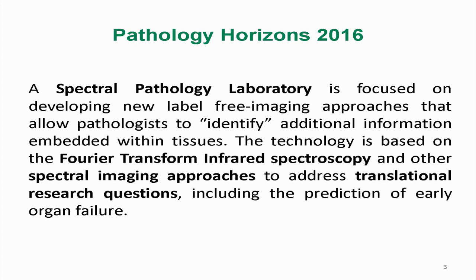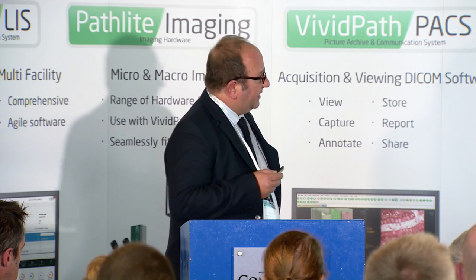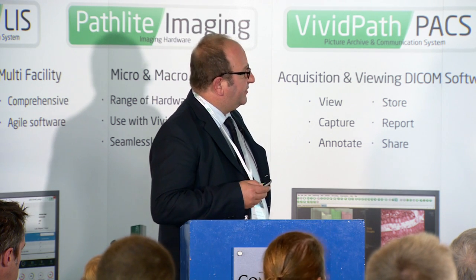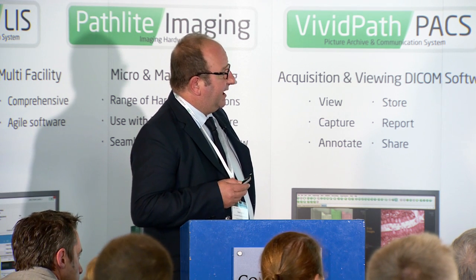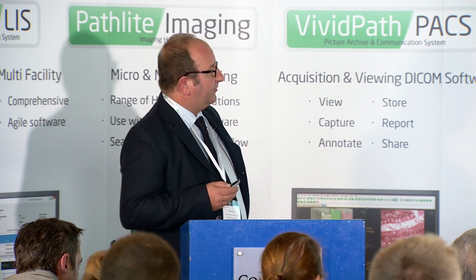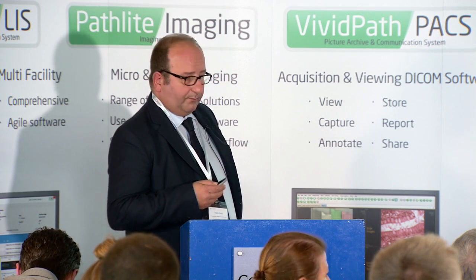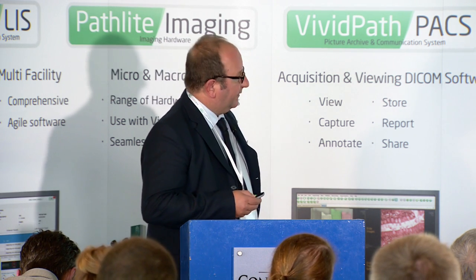But what is a spectral pathology laboratory? The Spectral Pathology Laboratory is focused on the development of new label-free imaging approaches that allow pathologists to identify additional information embedded within the tissue. The technology is based mainly on Fourier transform infrared spectroscopy and other spectral imaging approaches to address translational research questions.